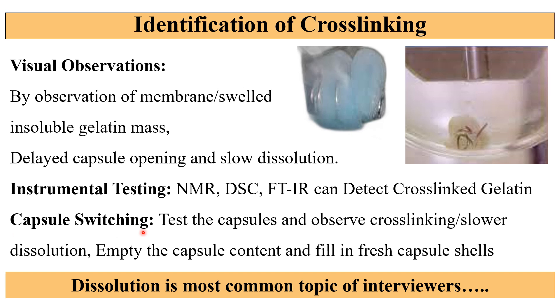Another method is capsule switching. In this test, if the capsules show crosslinking or slower dissolution, empty the capsule formulation on which the dissolution was done. Take that content and fill it into a fresh capsule, then perform the dissolution. If that dissolution is acceptable, then it means the earlier tested capsules were crosslinked.